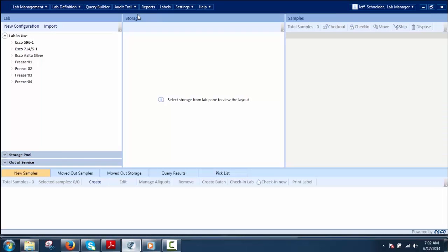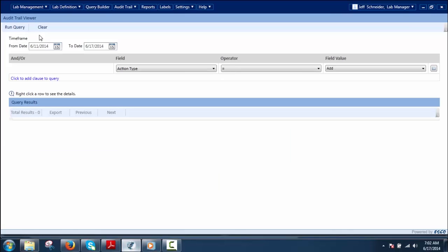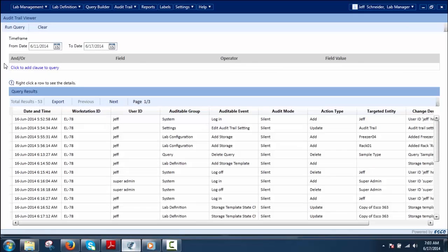In the Audit Trail Viewer, the user can view the history of audited log events. These events can be sorted using a query clause or by setting a time frame. The user can define a query to sort the audit trail history or set a time frame. If no query clause is defined, the query runs on the current one-week time frame. Set the time frame for the period of history to be sorted, then click Run Query to sort the history for the defined period.